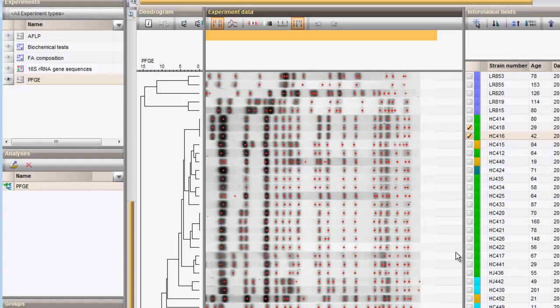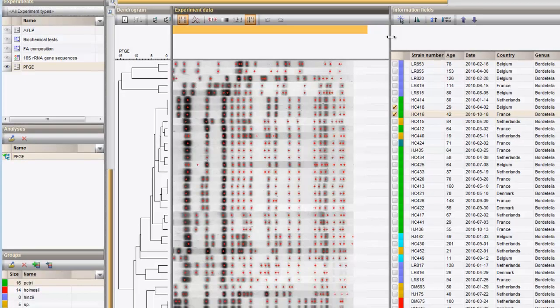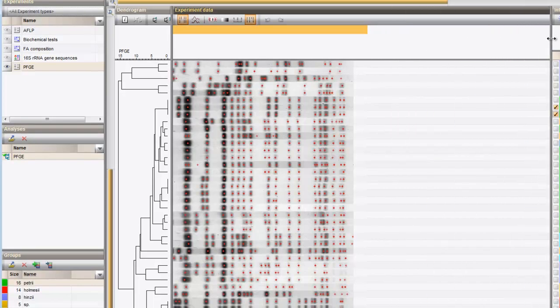To obtain more detail, I can change the size of the panels and zoom in on the patterns.